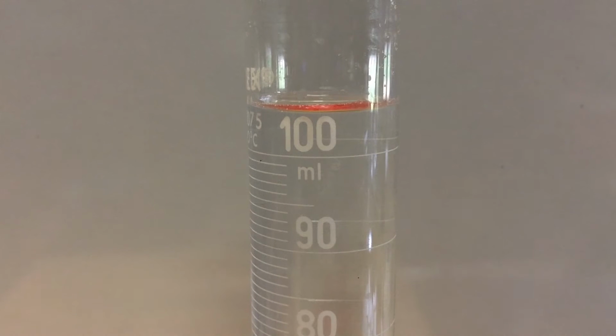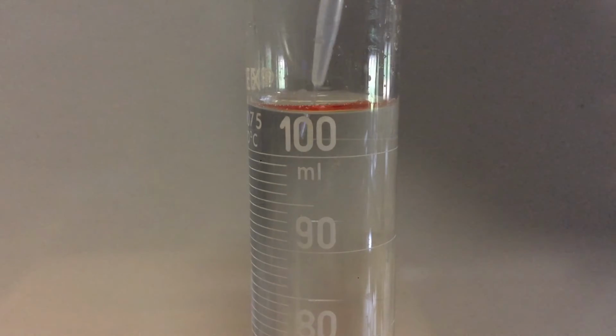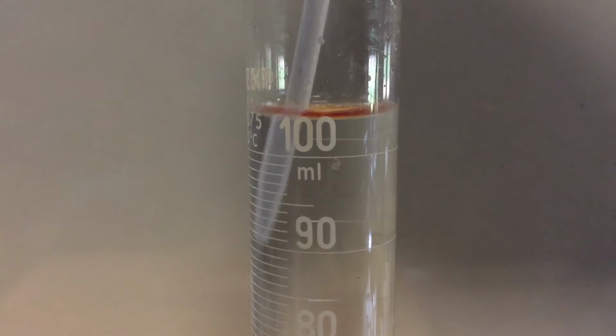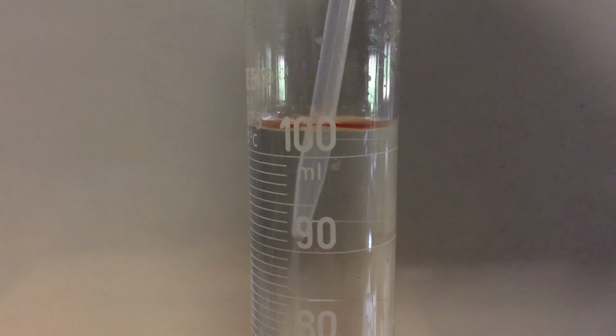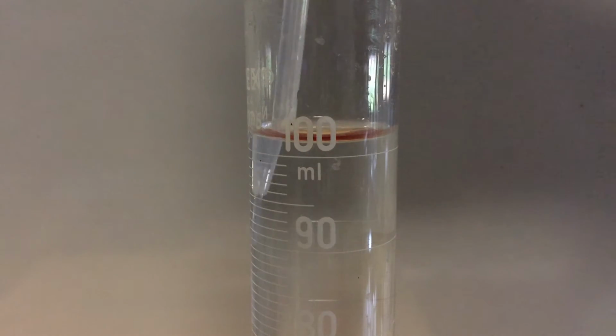So I clearly went over the 100 mark right here. So I'm going to take a pipette and pipette out the excess so that I can get to that value. Alright, a little more. Way past it, looks like.